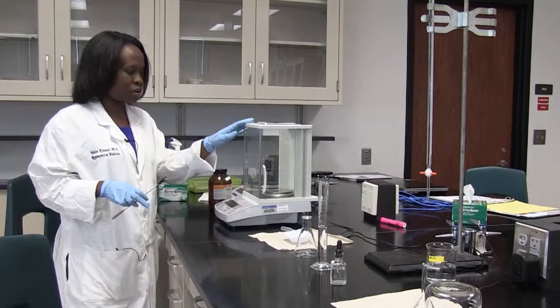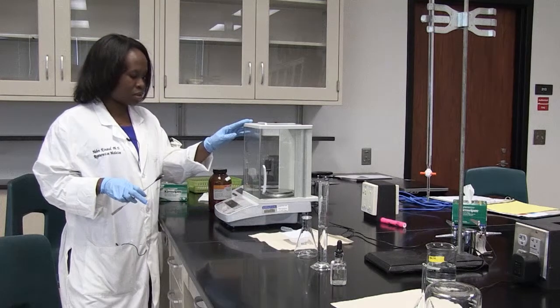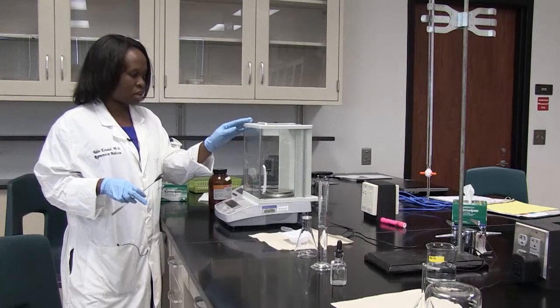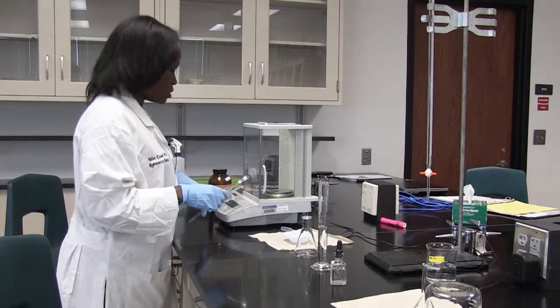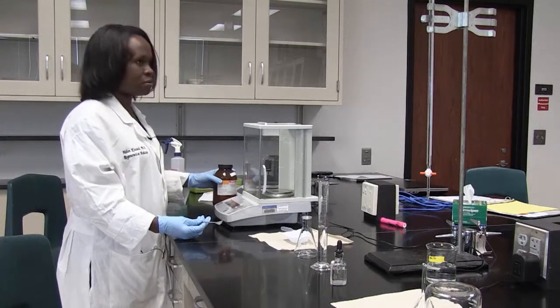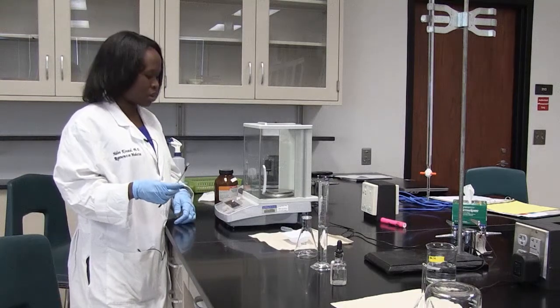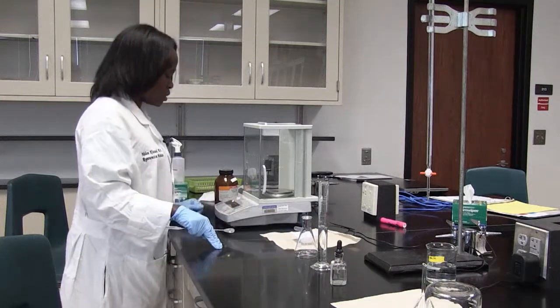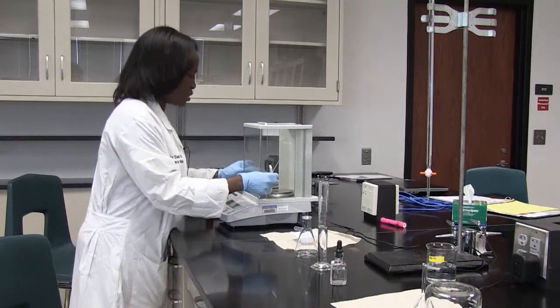This is slightly different from the electronic balance that I used in a previous video. This one gives a more accurate measurement of the substance that we're trying to weigh. The first thing we're going to do is weigh out our potassium hydrogen phthalate, and I'm just going to use KHP, so when I say that, you know I'm talking about the acid. As I mentioned before, you want to make sure that your balance is on. It's on here.